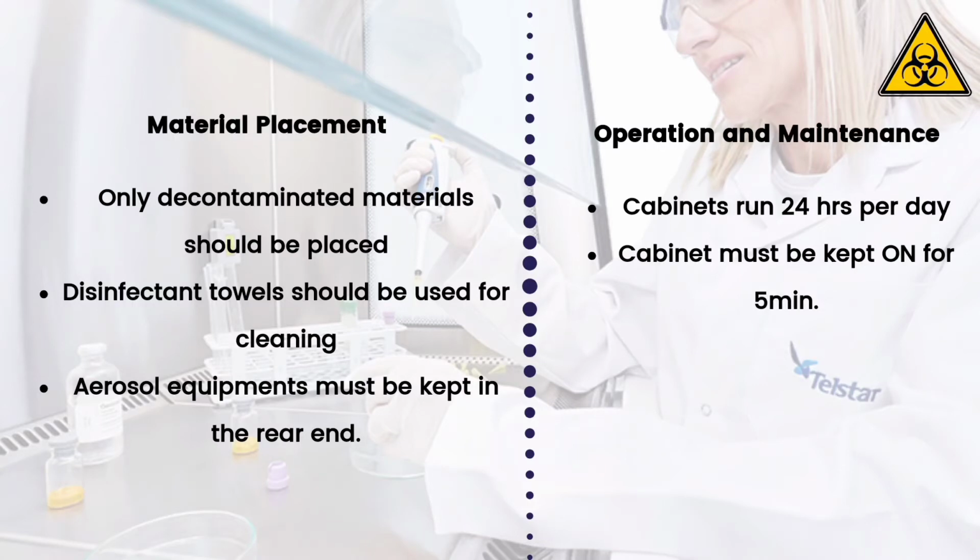Disinfectant soaked absorbent towels should be used for absorbing any spills or splashes of agents. All the materials must be placed at the end of the cabinet before the rear grille. Equipment generating aerosols, like centrifuges and pipette trays, must be kept towards the rear end.